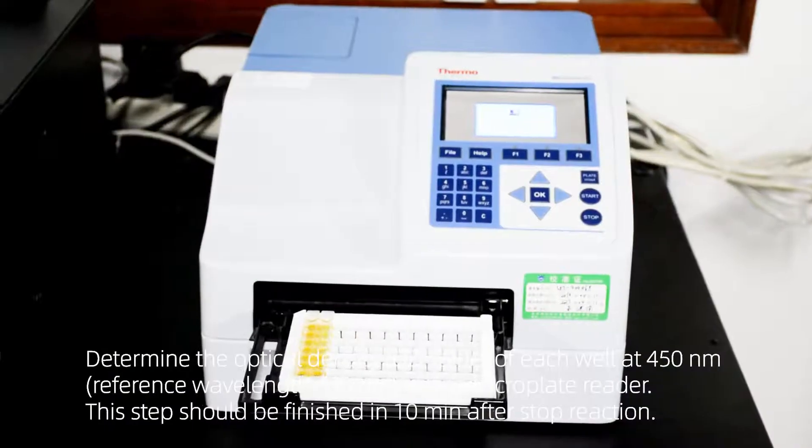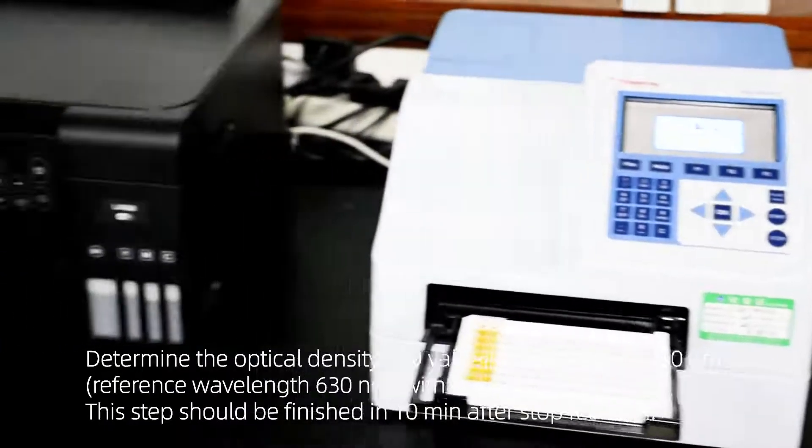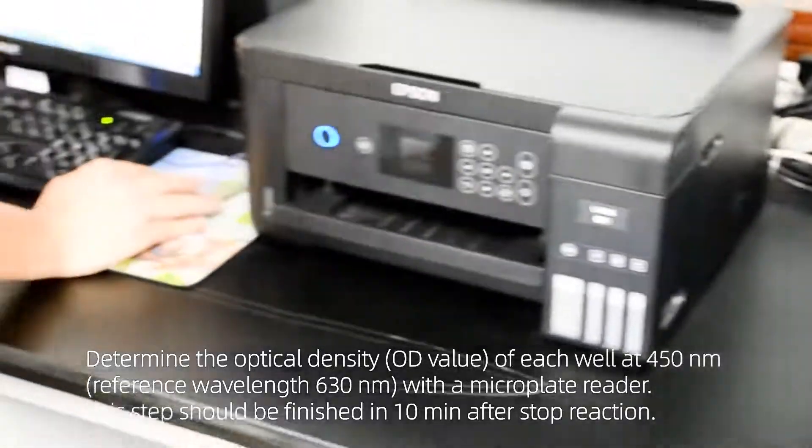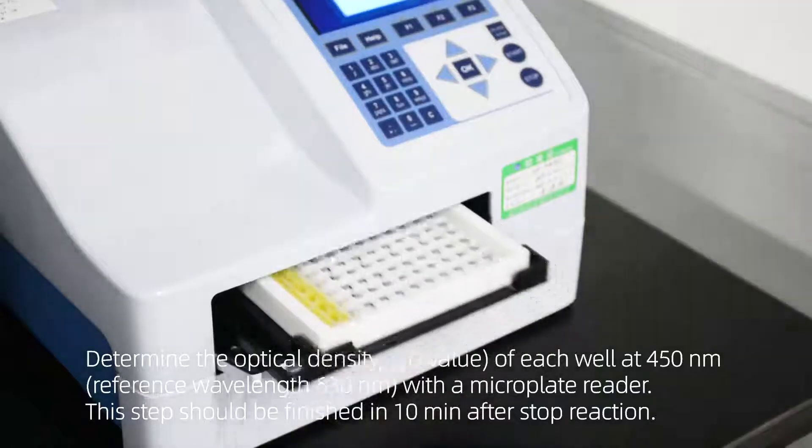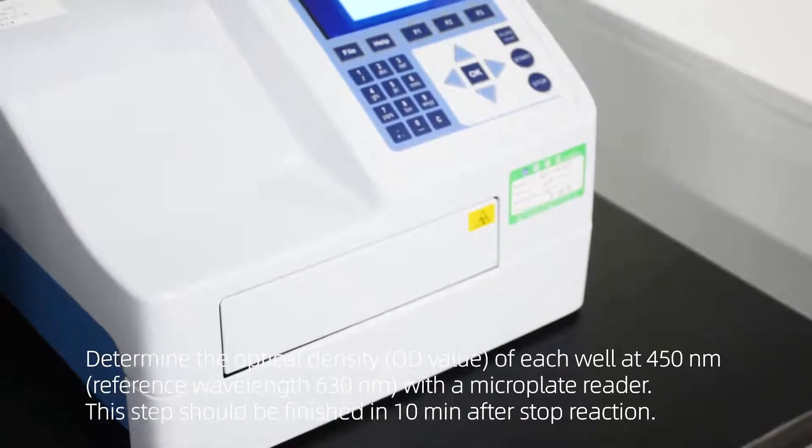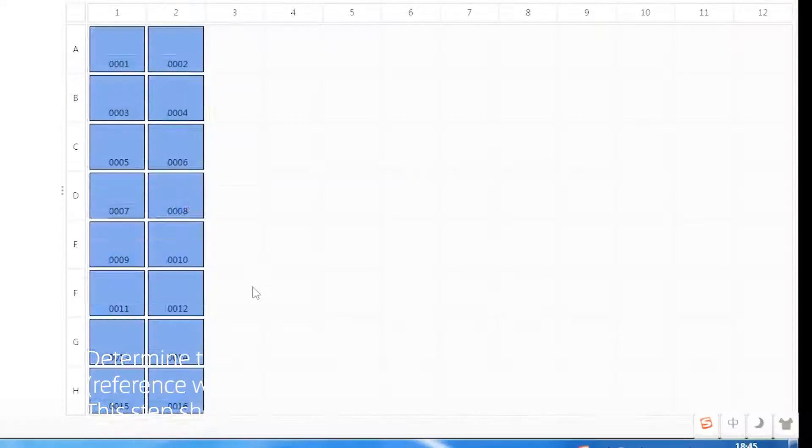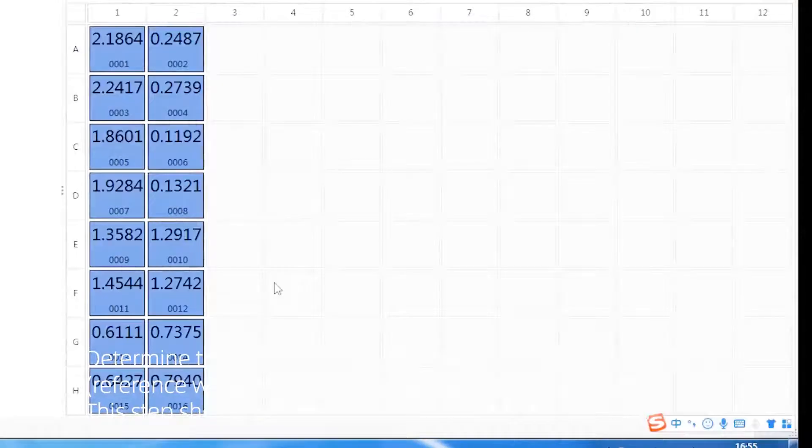Determine the optical density or OD value of each well at 450 nanometers, reference wavelength 630 nanometers, with a microplate reader. This step should be finished within 10 minutes after stopping the reaction.